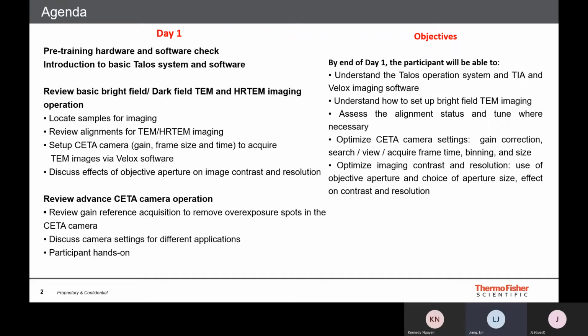You're also going to know how to do basic alignment to get good imaging, how to optimize the Ceta camera, like for the gain correction, how to search, view, and acquire images, and also how to optimize the image contrast and resolution by using different objective apertures.